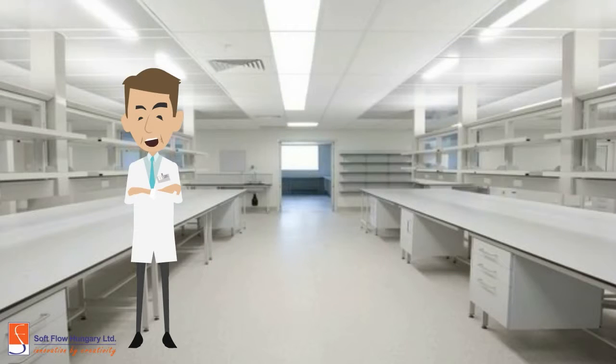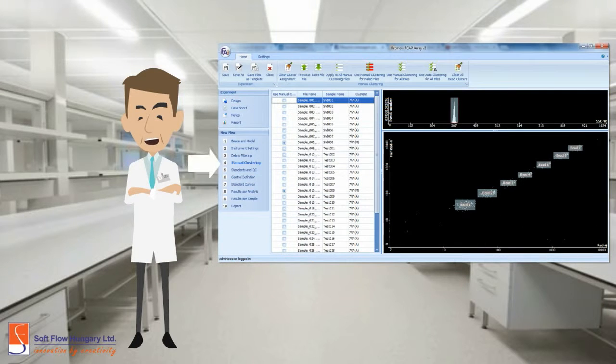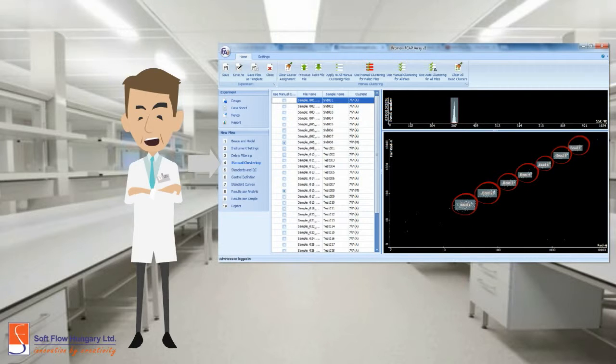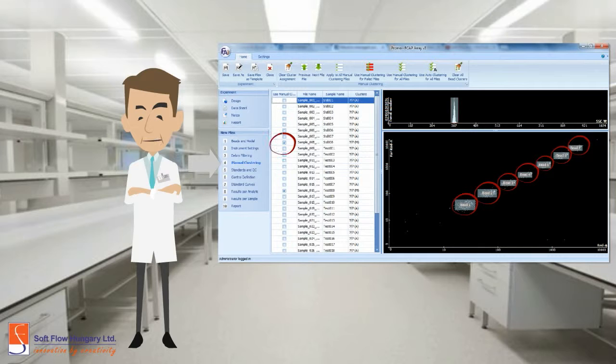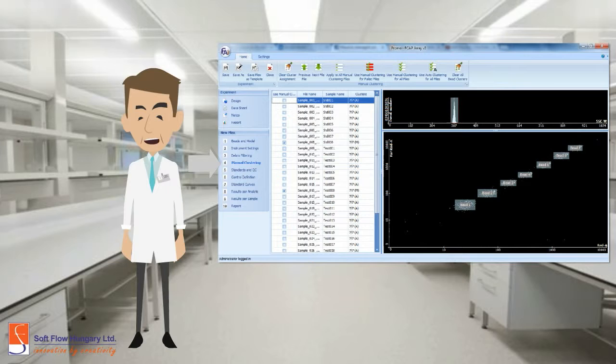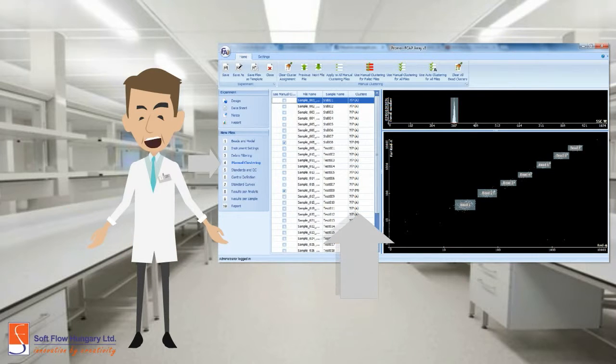You may not find all the clusters for every sample. For these failed files, you can apply the manual clustering, designing the clusters yourself, selecting the samples, positioning the bead area to the clusters and double-clicking to attach it. Besides, you can know which are the automatic and the manual clusters.